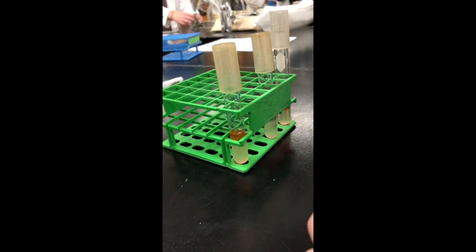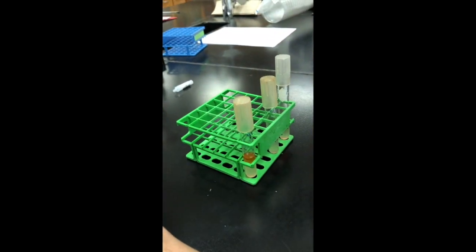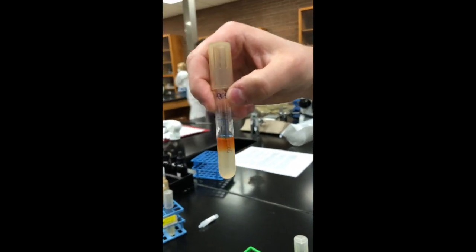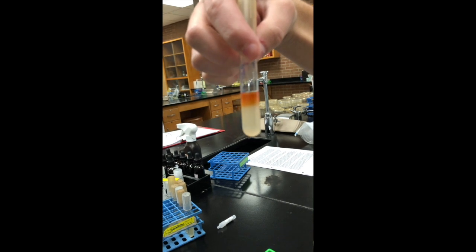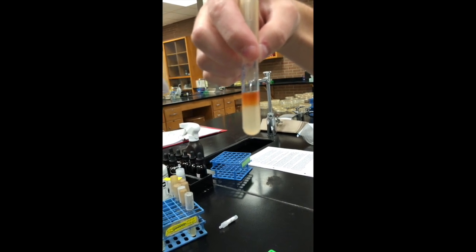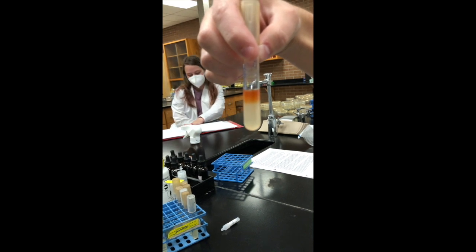Okay, so let's look at our results. So our first tube, Ethan is going to hold up. This is Enterobacter, and it didn't turn a bright red color. It stayed orange, so this tells me that my organism probably isn't undergoing mixed acid fermentation.